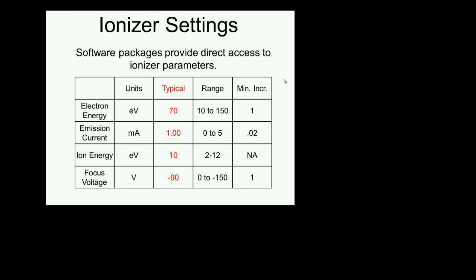But at least, hopefully, I'll get you thinking: hey, maybe I'm going to be doing UHV, so maybe I need to think about the emission current. I'm going to be operating at higher pressure, so I need to think about the emission current. I'm going to have gases that might coat my ionizer. I know now I have a knob to get a little more sensitivity, and when to order a replacement ionizer, and so on.